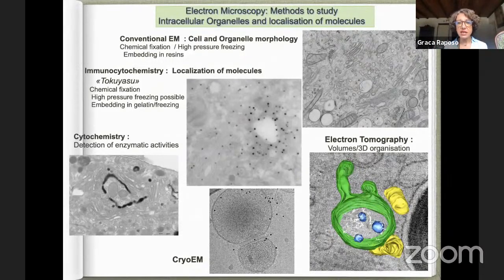So this is just a patchwork of these different techniques. So you have the conventional EM here. Somehow my arrow is not really working, so it's a little bit difficult. But you have the conventional EM, where you can appreciate here on the top, sorry, the Golgis, the different organelles, the mitochondria. In the center, you have an example of immunolocalization using two different types of gold particles with two different sizes. Again, you have a nice Golgi, you have an endosomal compartment.